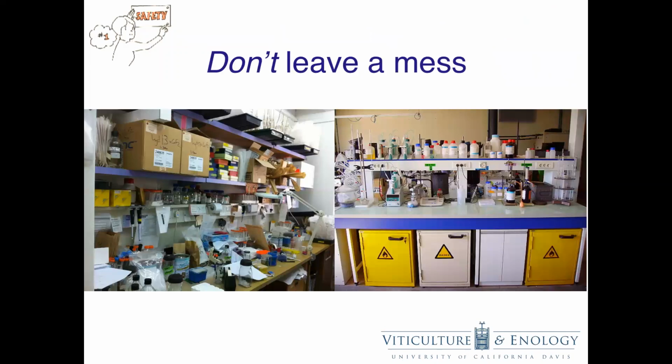Don't leave your lab a mess. Each lab should be clean, organized, and free of clutter. All chemicals and solutions should be properly labeled and stored. A clean and organized lab helps to prevent accidents.